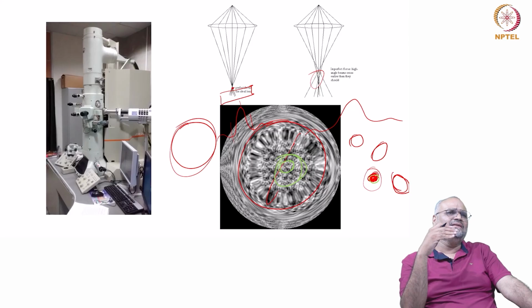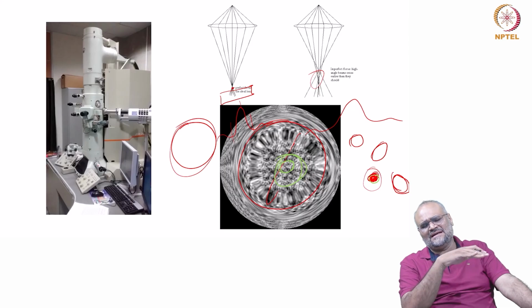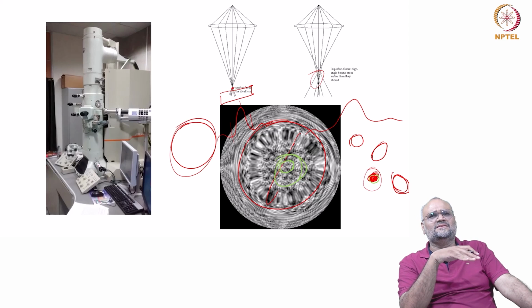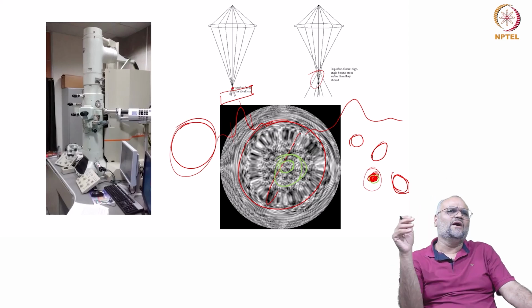I have to then go to a complete blank area or a hole, and I have to set my detector with background noise correction, bring the specimen in, look at how the signal appears, and try to achieve the optimum contrast while I am imaging.